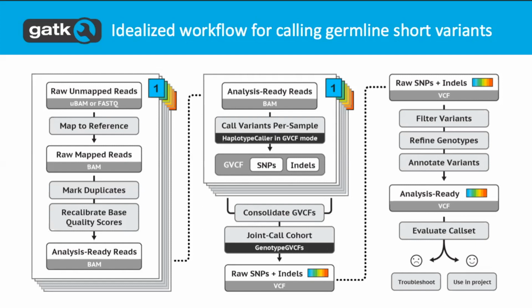The difficulty, for the most part, is in the filtering. For filtering, we do a pretty good job when we have a lot of samples. For multi-sample analysis, from a few dozen up to a few dozen thousand samples, we have that pretty well in hand.